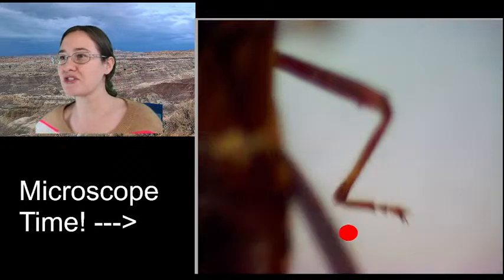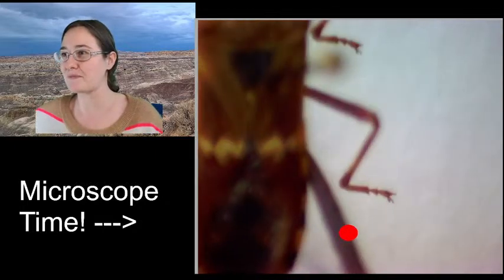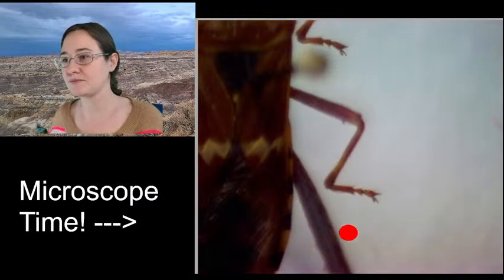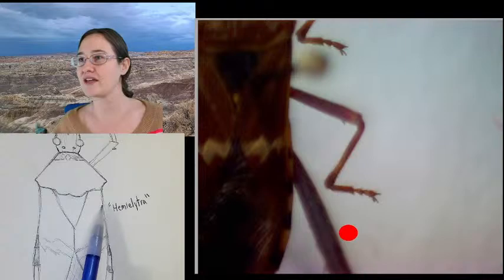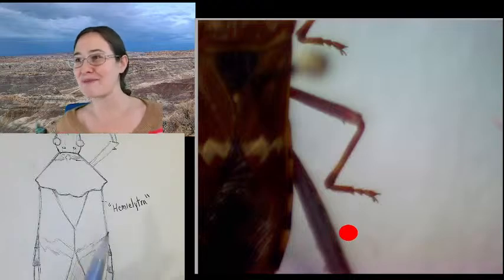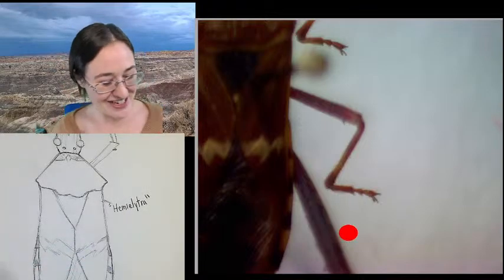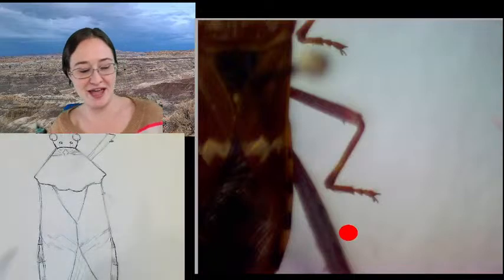All right, I'm going to zoom out just a little bit. I just want to see where this leg is coming out from our body. So looks like the leg comes out pretty much right here. You know, I've got the worst luck with where I write things on my paper. I'm always going through words that I've described to you guys. Oh, man. We're going to erase it. Luckily, I wrote it in pencil. We all know that we're working next to the hemelytra now.